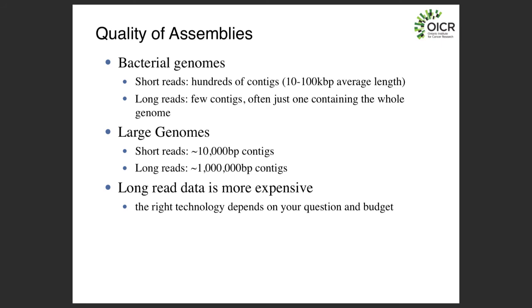The reason for this is that in many bacterial genomes, the longest repeat is around 6,000 bases, which is the ribosomal RNA sequence. If you have reads that are longer than 6,000 bases, you'll typically be able to span that repeat and then be able to assemble your genome.